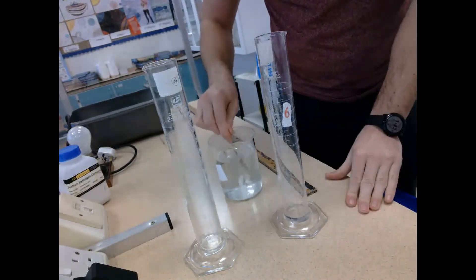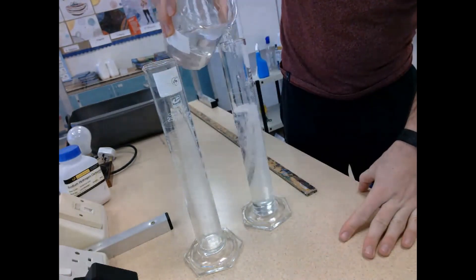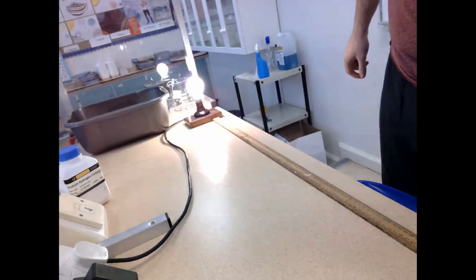Now once I have my graduated cylinder set up, it is now time to set up the lamp. What I'll do is I'll place this lamp one meter away from my graduated cylinders, and then I'm going to take my elodea and get this ready.